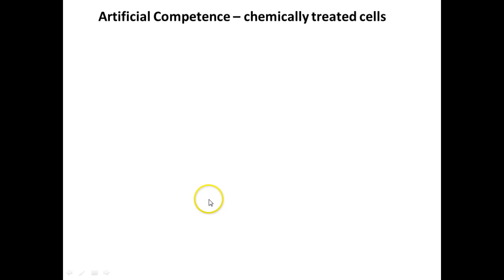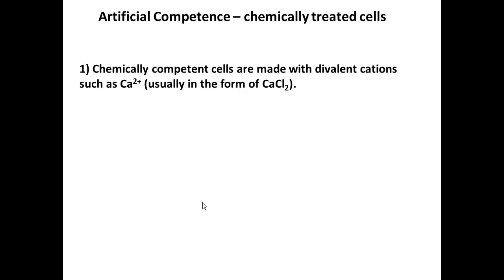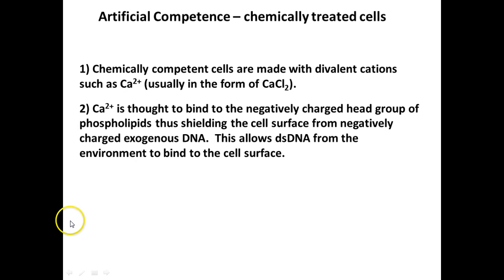We use chemically treated cells. So these come pre-treated, and we're going to utilize a chemical solution. We're going to be using calcium chloride solution. This is the transformation solution. It's already in the tubes that you will be supplied today. We're just going to add the special strain of bacteria that are affected by this chemical, the E. coli that we'll be using today. Those calcium ions really help in the penetration of the DNA into these cells. We're going to do it by a chemical means.